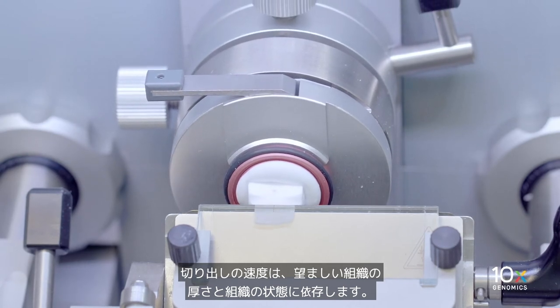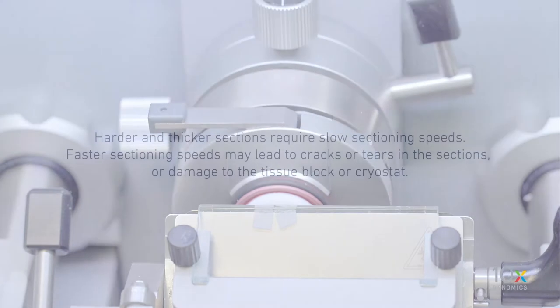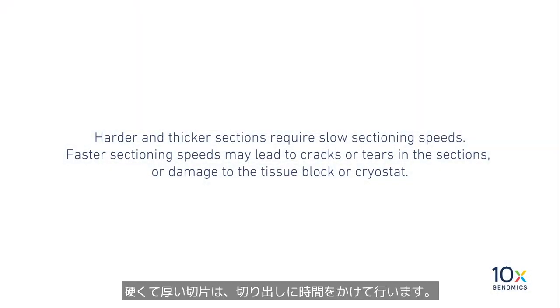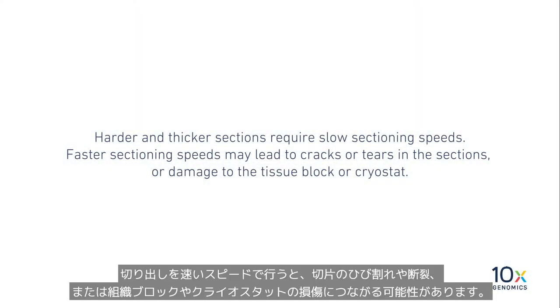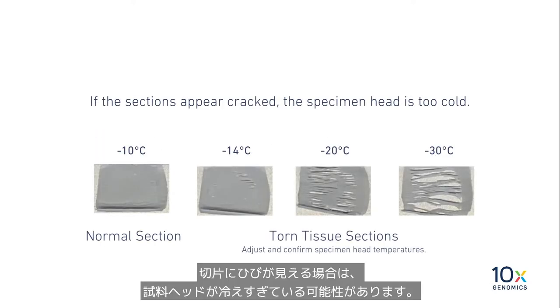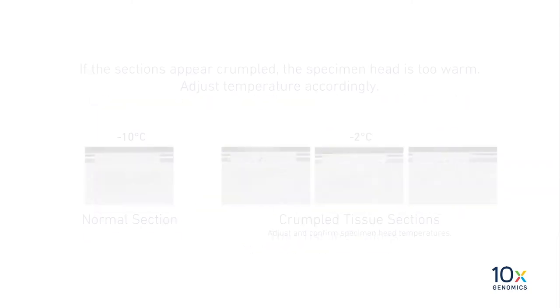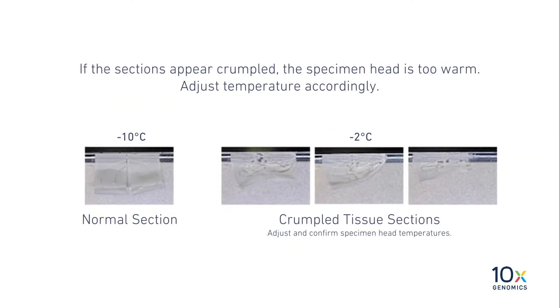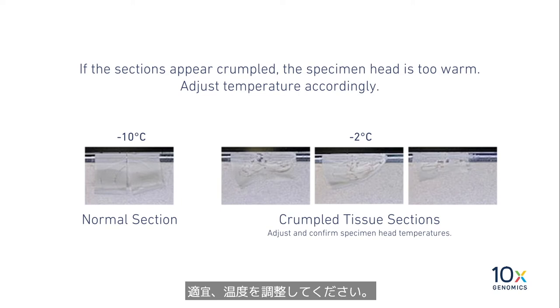Now we are ready to section the tissue. Sectioning speeds depend on the desired thickness of the sections and the condition of the tissues. Harder and thicker sections require slow sectioning speeds. Faster sectioning speeds may lead to cracks or tears in the sections or damage to the tissue block or cryostat. If the sections appear cracked, the specimen head is too cold. If the sections appear crumpled, the specimen head is too warm. Adjust temperature accordingly.